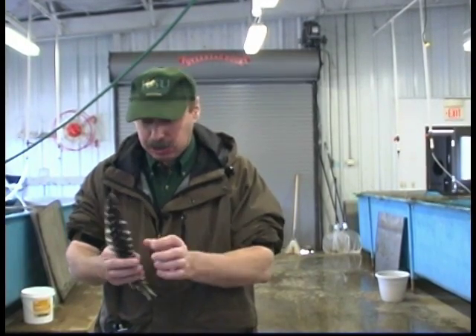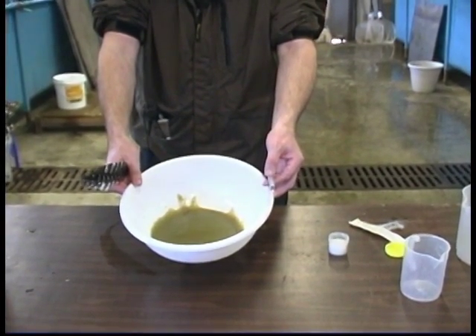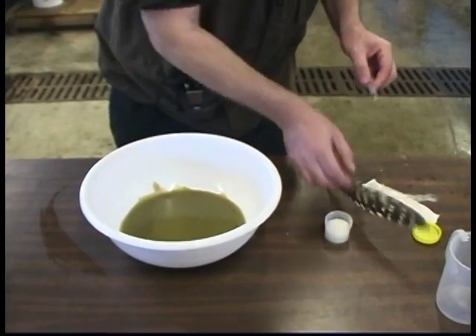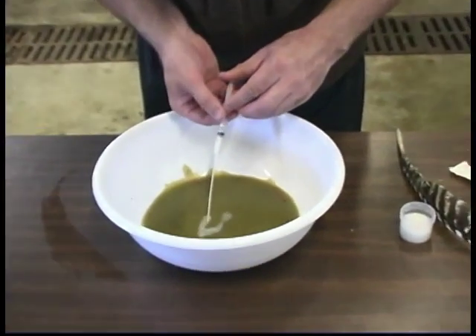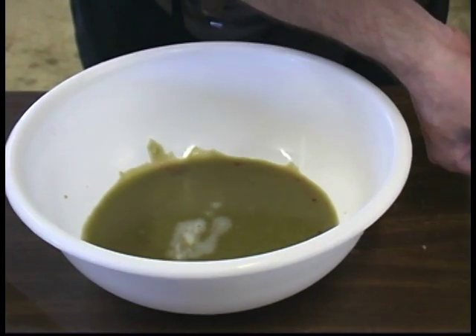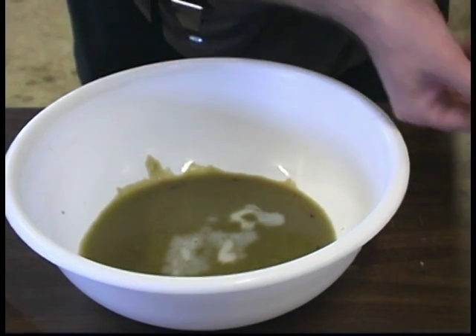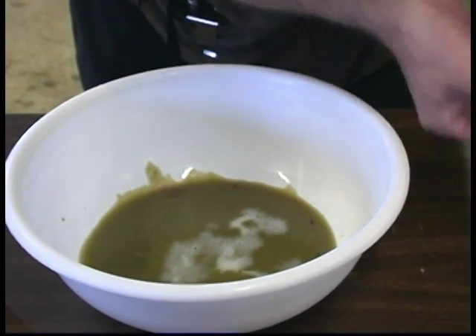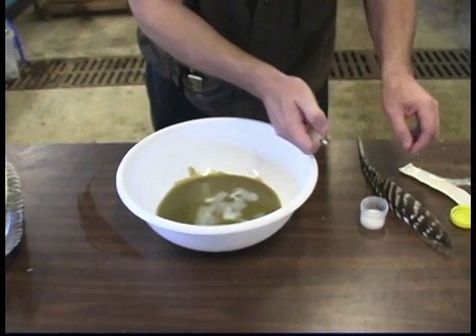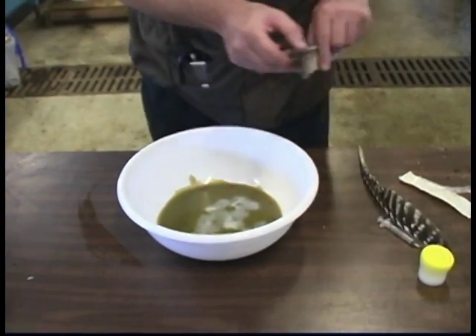Now we perform artificial fertilization of eggs. You can see here 250 grams of eggs. Now I add sperm. In this case, the sperm is a little diluted, so I put in maybe more than needed. From this male, it was a special cross and this male had very diluted sperm. Now I mix the eggs and sperm together.